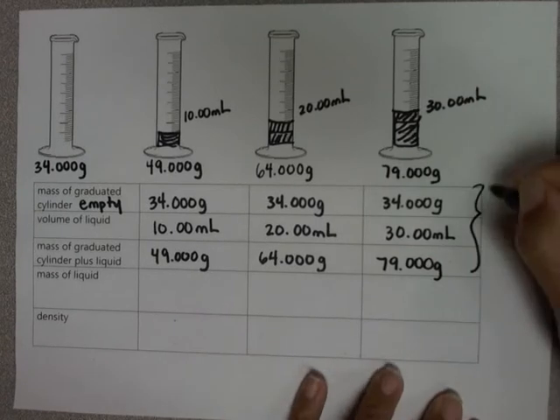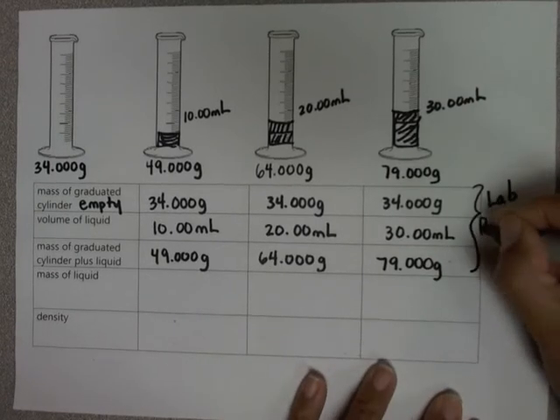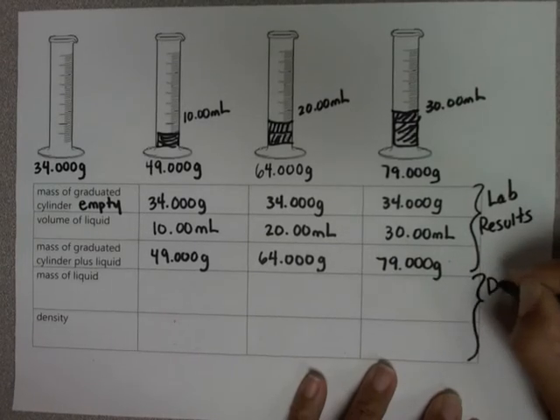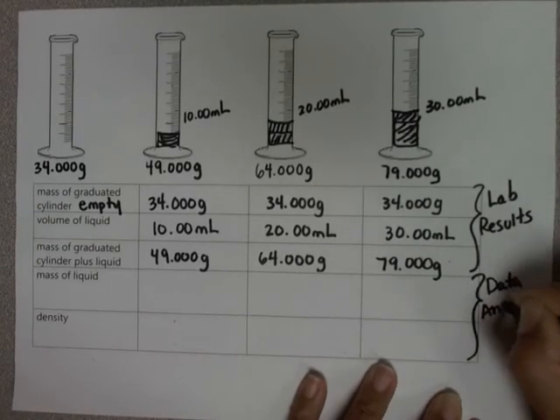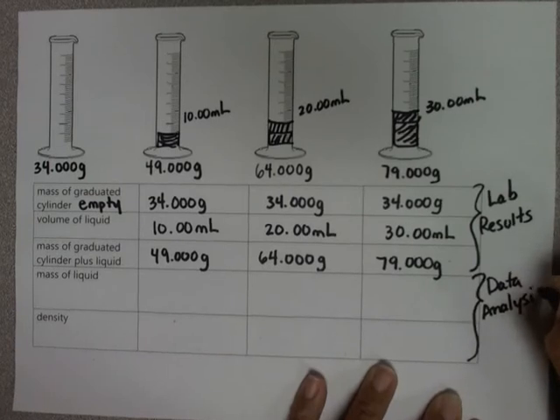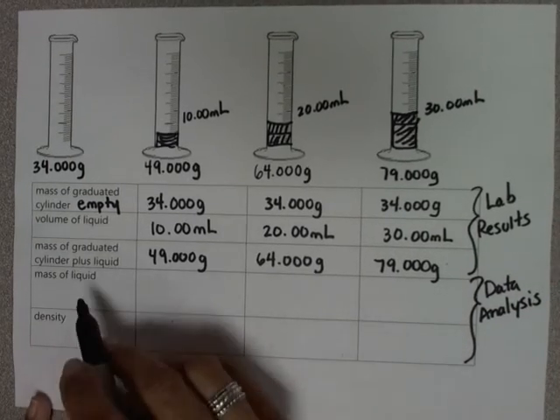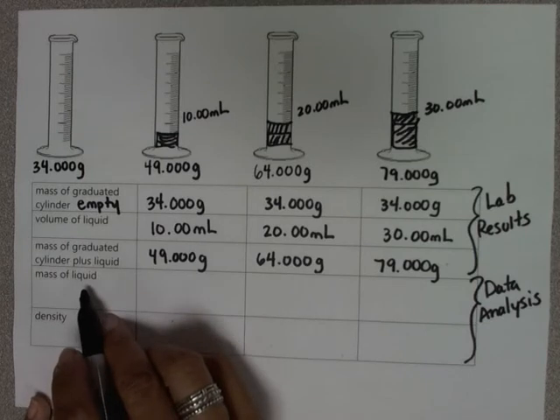Okay, so these are my lab results. And now I need to do the data analysis. I need to find the mass of the liquid alone.